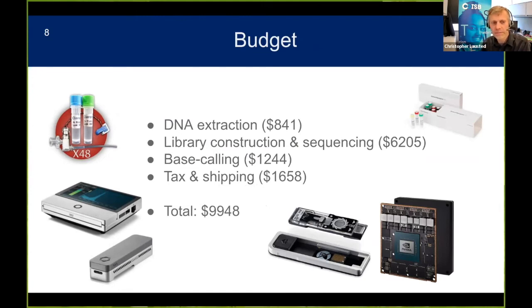So ultimately half the cost will be the sequencing flow cell, and half will be DNA extraction, getting the DNA out of the sample. So we work to bring down both of those costs as much as we could.